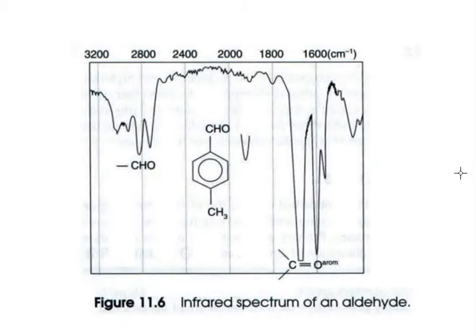The next spectrum. This is a spectrum of an aromatic aldehyde. This group is a structural abbreviation. It's kind of hard to see what it is, but it's a carbonyl group with a hydrogen attached to the carbon. It's an aldehyde group. We mentioned that aldehydes, the CH stretch, produces two peaks at 2720 and 2820, and there they are, the peak here and the peak here. 2820, this peak here, 2720. Those are produced by the aldehyde CH stretch.